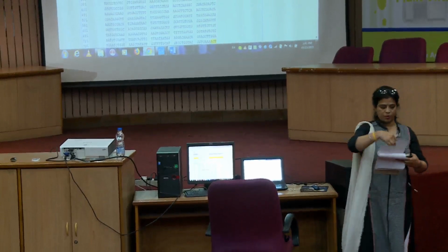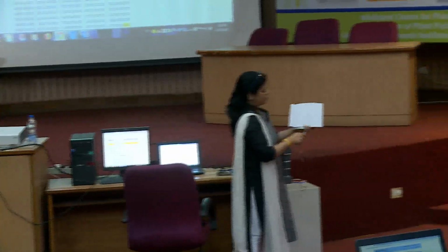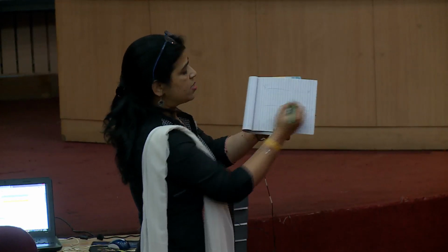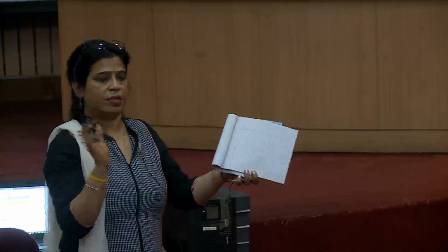Let us suppose this is your double stranded sequence. Everybody can see it. This is your 5 prime to 3 prime and this is your 3 prime to 5 prime. This is how we have our genetic material, right?